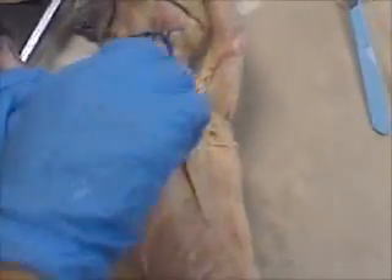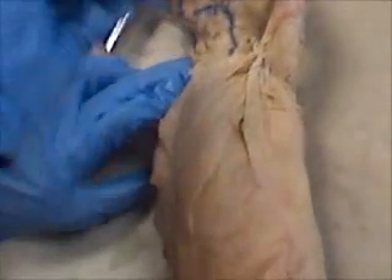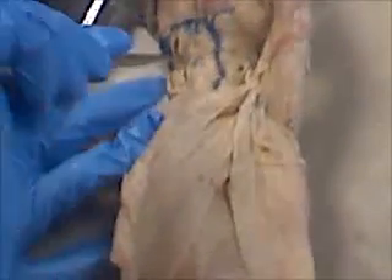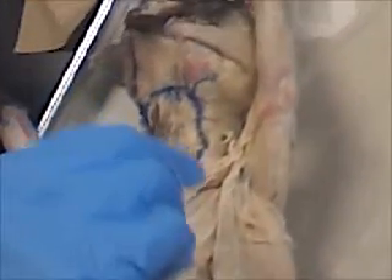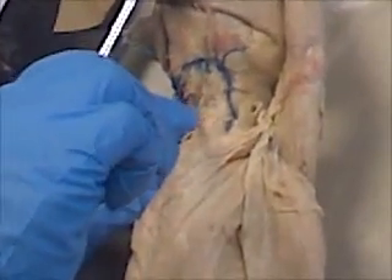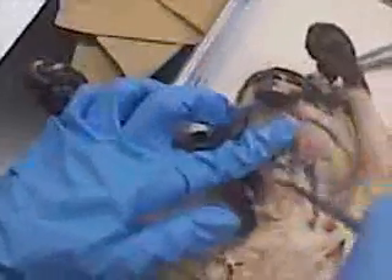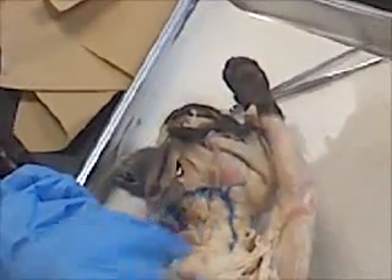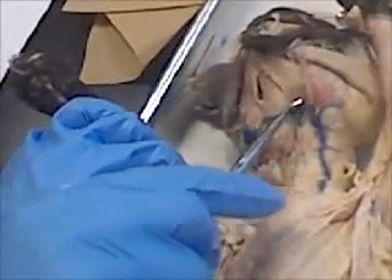Then we go up here and we're going to draw the sternomastoid. We got the sternomastoid, we got the sternohyoid. That's the thyroid cartilage, right? And this is the digastric. Then this is the what? Mylohyoid. Good job — mylohyoid. This is the masseter.